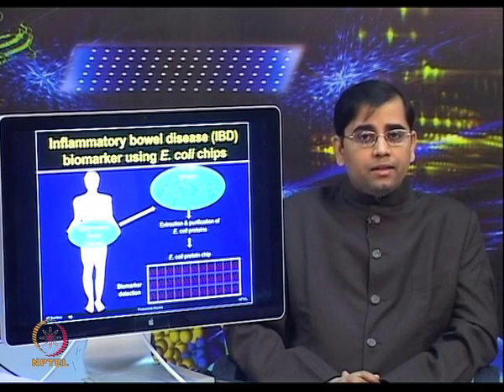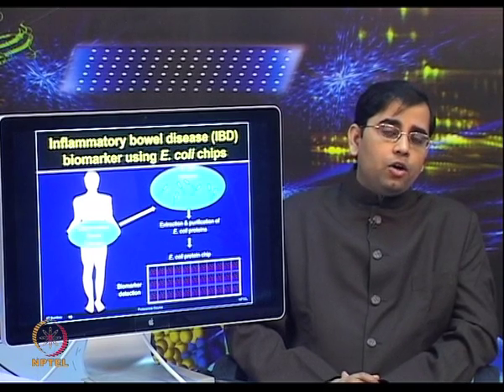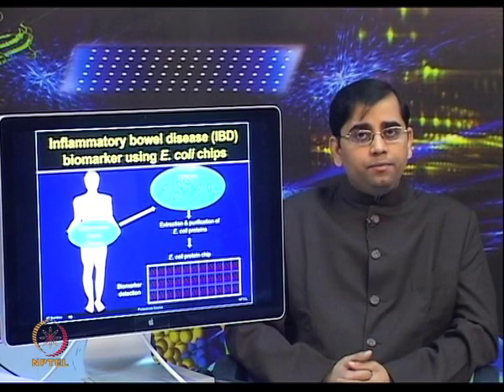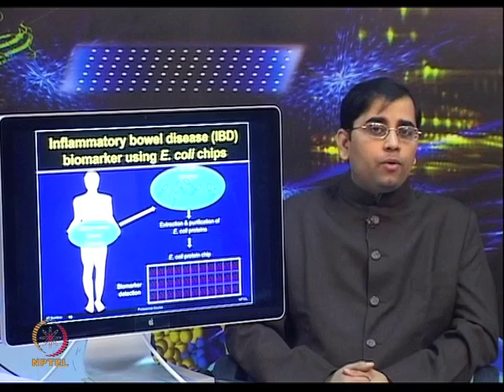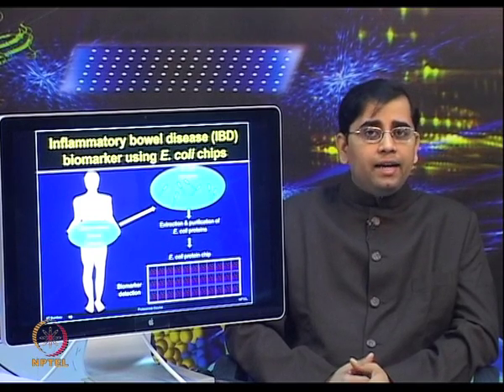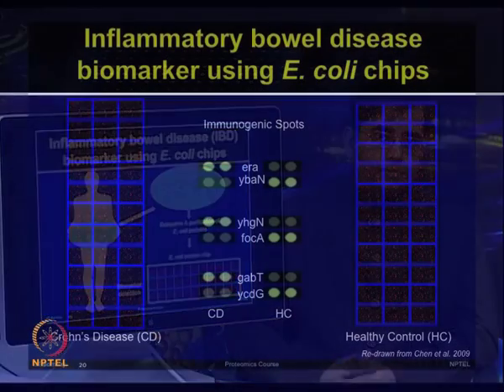The protein spots that were recognized by the serum antibodies were visualized and quantified by using Cy3 labeled goat anti-human antibodies.